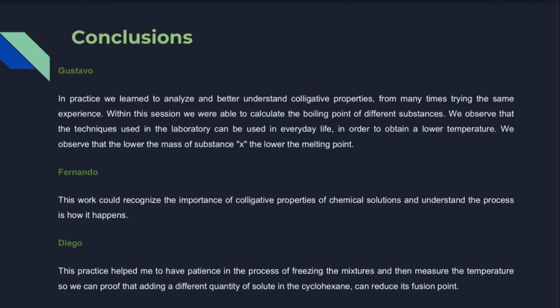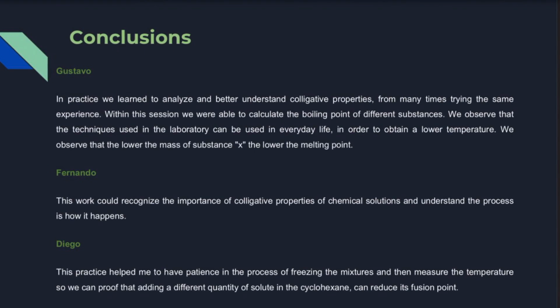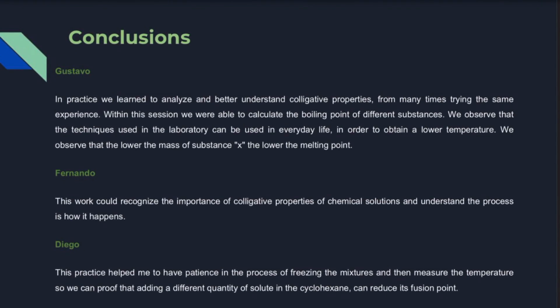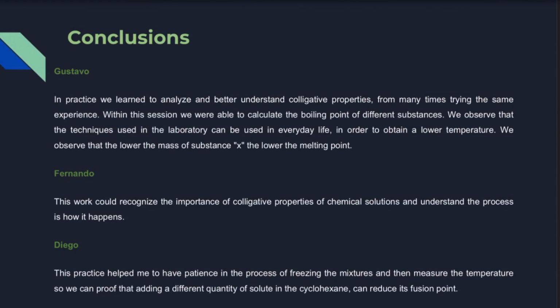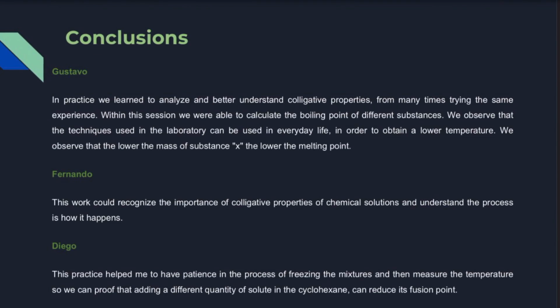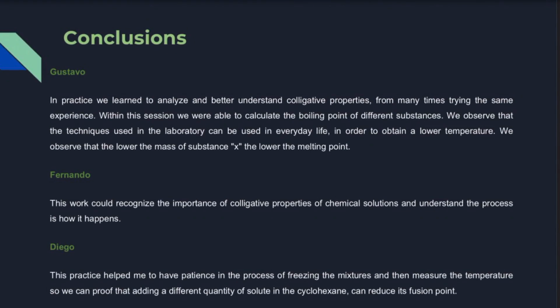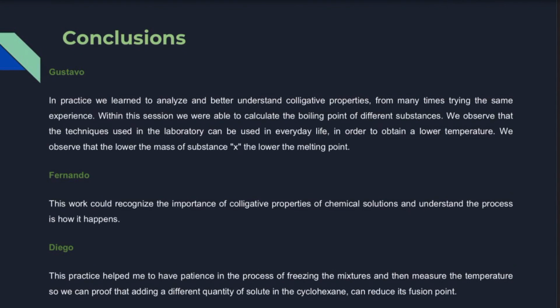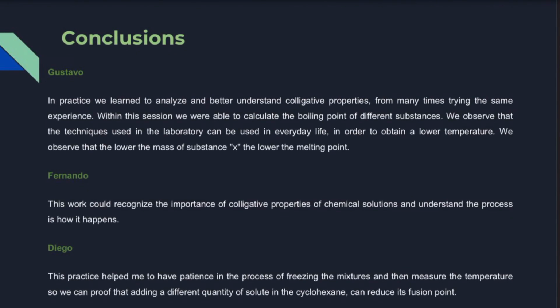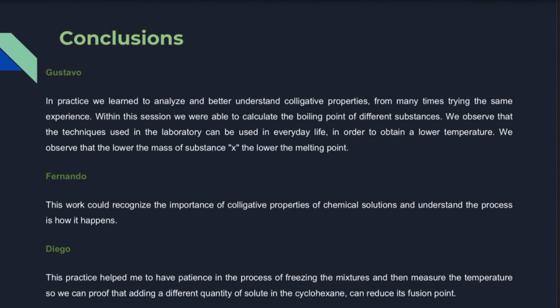This workshop recognizes the importance of colligative properties of chemical solutions, and understanding this process is what happens. This practice helped me to have patience in the process of freezing the mixtures and then measuring the temperature, so we can prove that adding a different quantity of solute to the cyclohexane can reduce its fusion point.